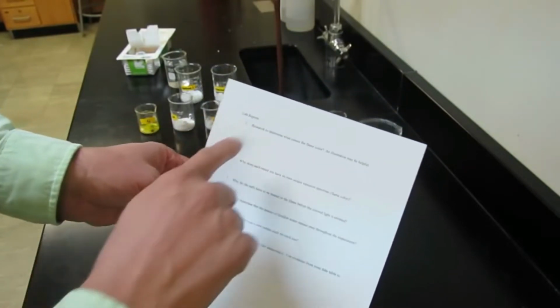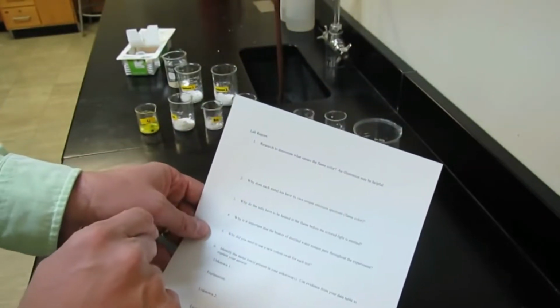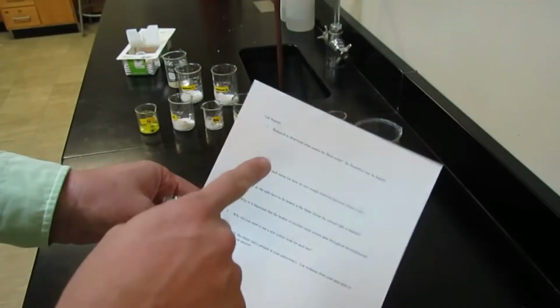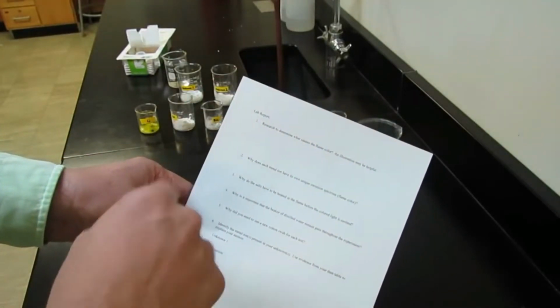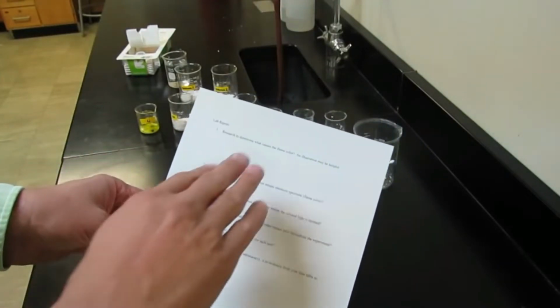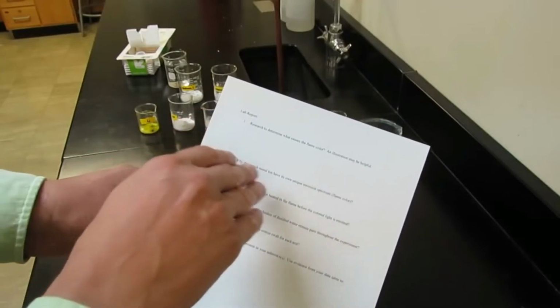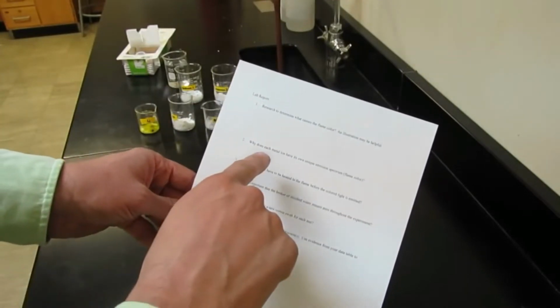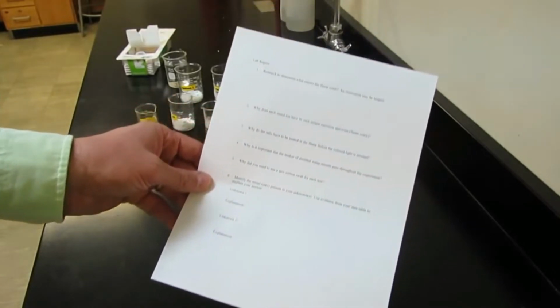So number one, research to determine what causes the flame color. I really want you to consider what causes that color from the flame, and don't write something like, well, it's the chemicals reacting. Please think about it. We've talked about it in class, and you might want to do a little bit of research on your own, and so on down the paper.